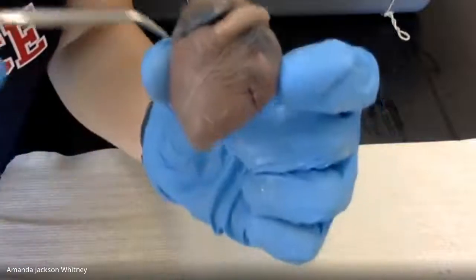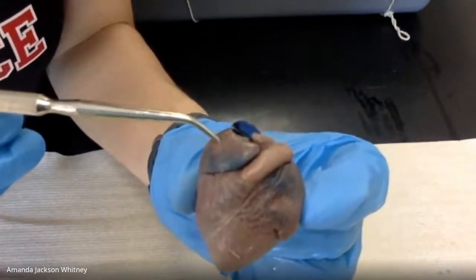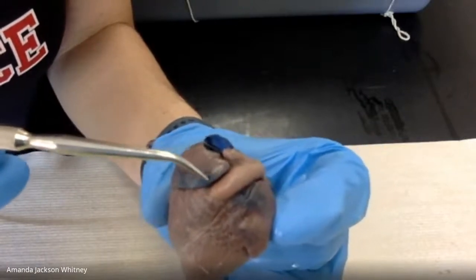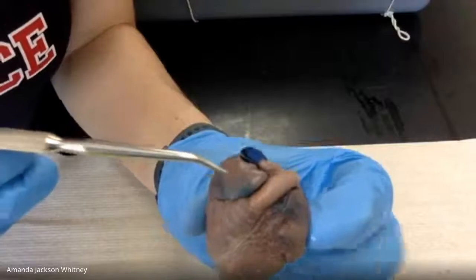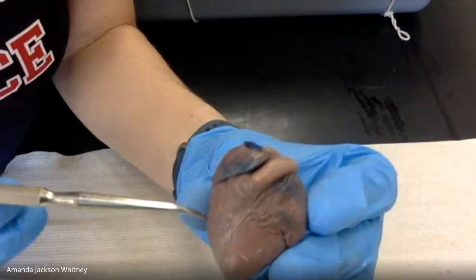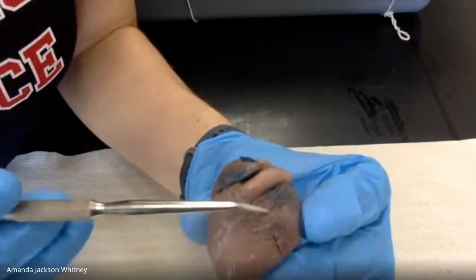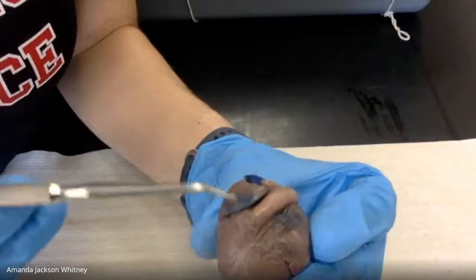So what chamber do you think this would be right here? Is it the right atrium? Good, yeah, right atrium. So here's the right atrium. Right ventricle is down here. Left ventricle down here. And then what would this be right here? Left atrium. Left atrium, good.